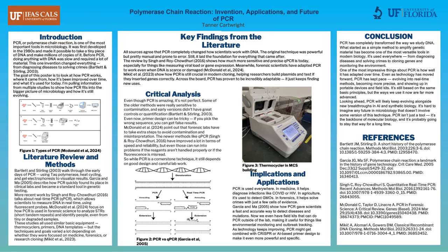Critical analysis. Even though PCR is amazing, it's not perfect. Some of the older methods were really sensitive to contamination, and early versions didn't have great controls or quantification. Even now, primer design can be tricky. If you pick the wrong sequence, you can get false results.